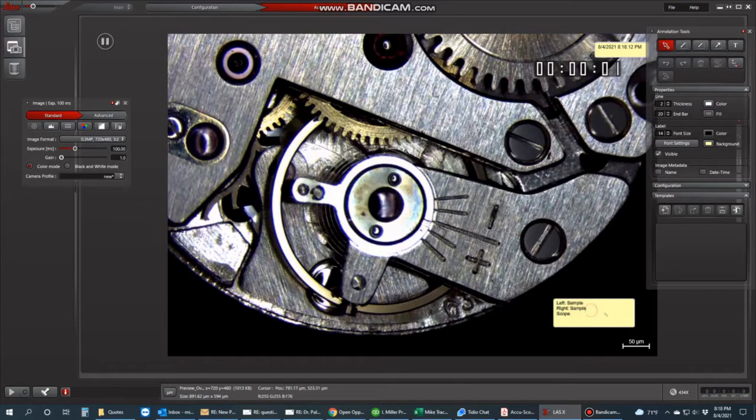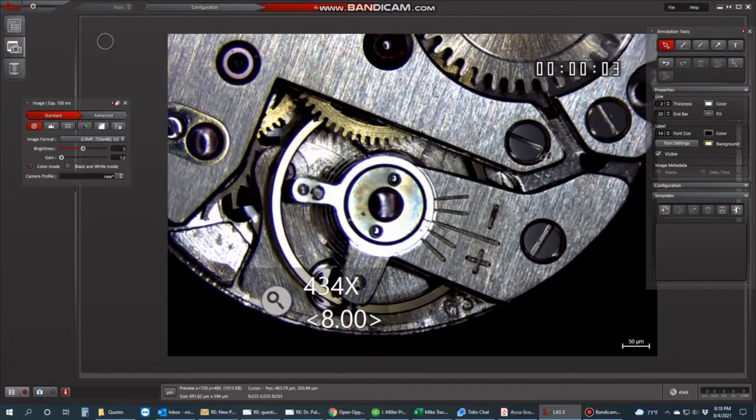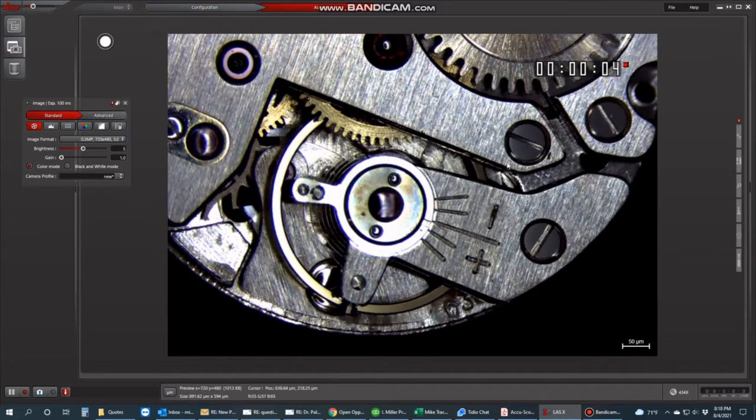I can't move this text box. It's burned in and merged to the image. That's what I understand you're looking for. Okay, we're happy with that. Now, just to reiterate a few things, I'll go through this process one more time real quick, and you should be happy with the results.